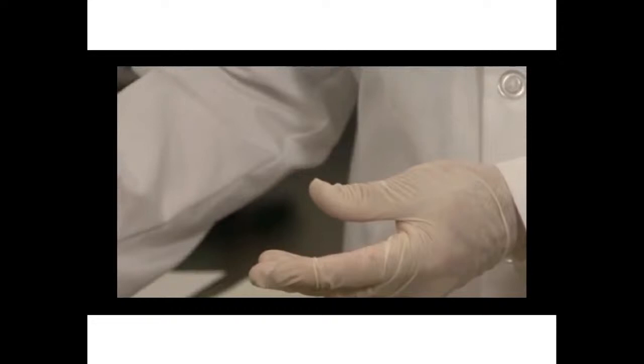Add 2 milliliters of equilibration buffer number 1 to each lane of the rehydration tray that you have a strip. Place the rehydration tray onto a shaker rocker table for 15 minutes.